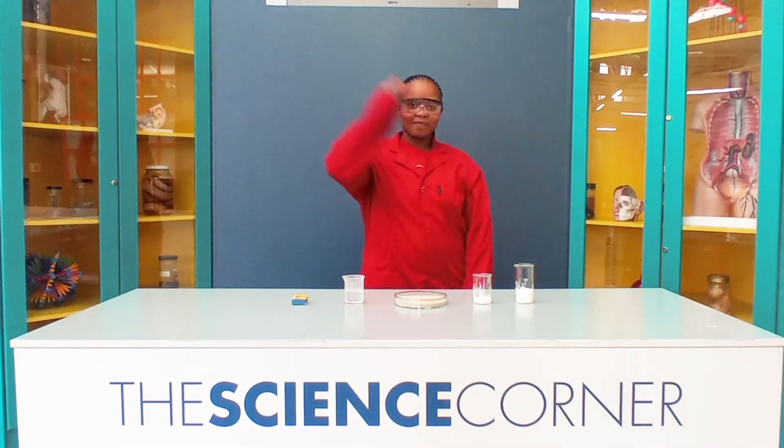For safety, I am wearing a lab coat, safety goggles, and just in case, we have our fire extinguisher.